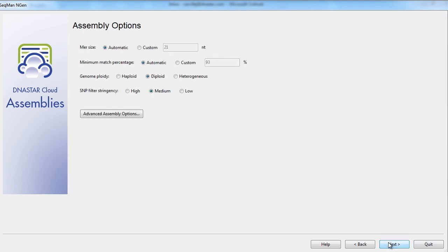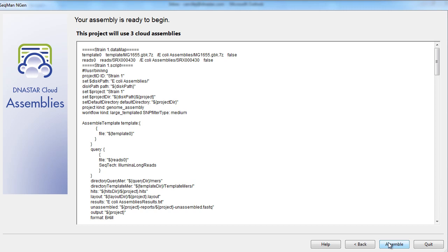Finally, we can choose to adjust our assembly parameters if desired. The default parameters here work for most projects. Now we've finished setting up our project. At the top of the screen, we can confirm how many assemblies are running. Next, you can click assemble to begin.